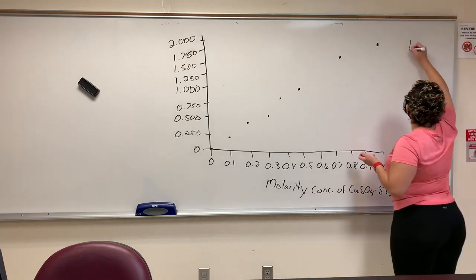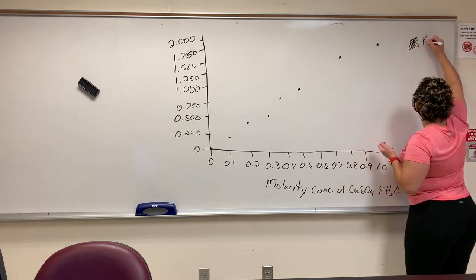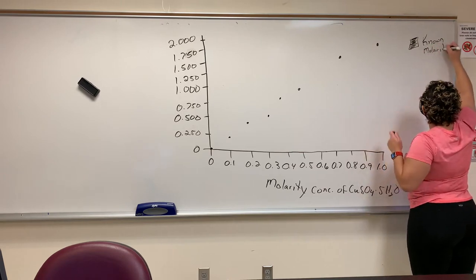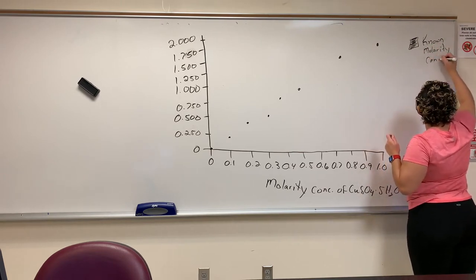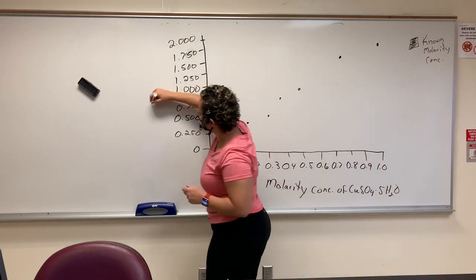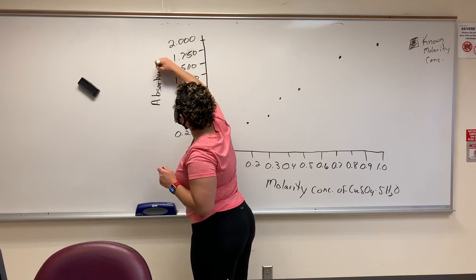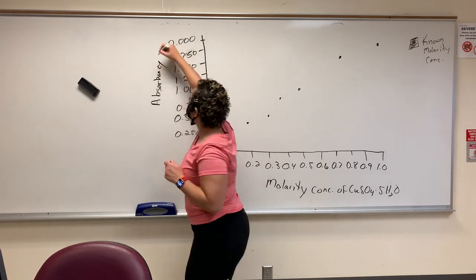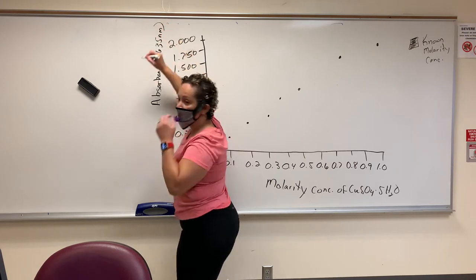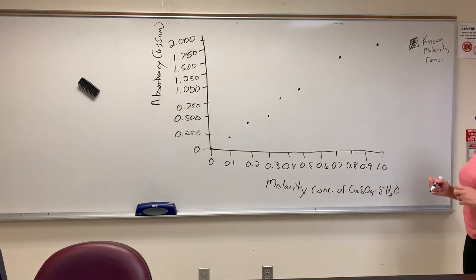Let's put that on the key. Black, known molarity concentration, C-O-N-C, concentrations. Oh, I forgot a label over here. Now that we got these numbers, absorbance, A-B-S, absorbance, and put the nanometers on it. It was at 635 nanometers. I'm giving you all kinds of good stuff, okay?